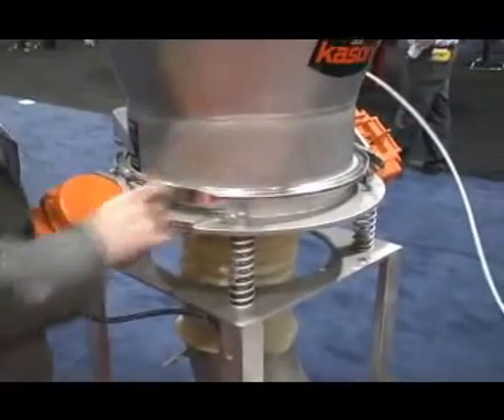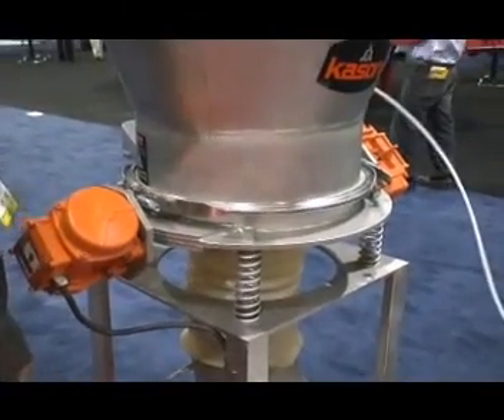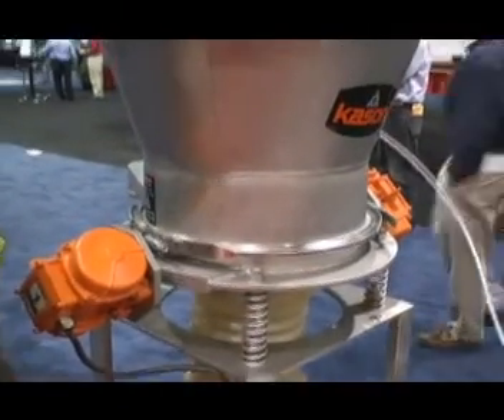The fluid bed chamber itself has a certain bed depth of material that we control with an adjustable weir to control the retention time of the material inside the fluid bed chamber.